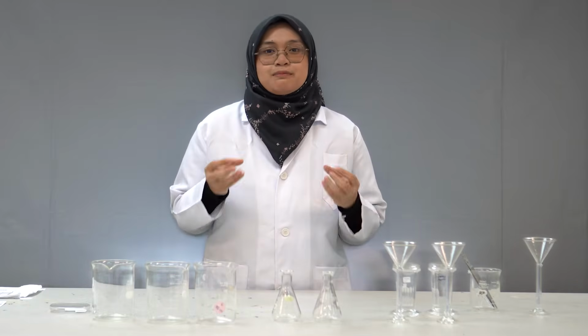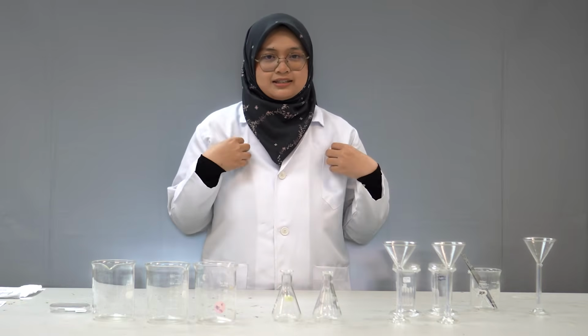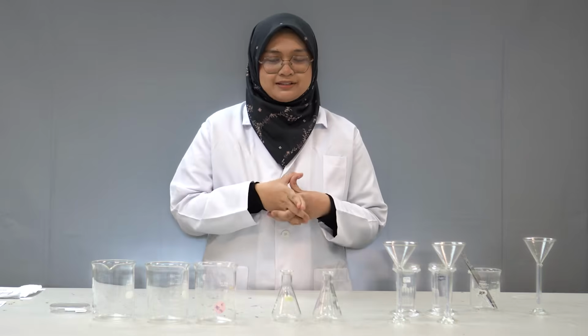Before we do any experiment, we have to wear proper lab attire, such as a lab coat and gloves. This is very important because we are dealing with chemicals, so we want to protect ourselves from any harmful chemicals.